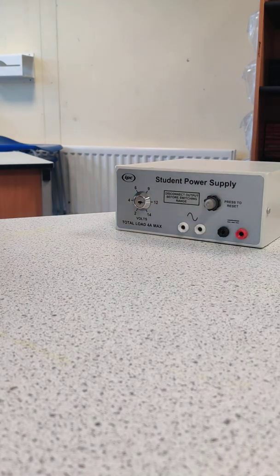In today's lesson we're introducing the idea of electrolysis, a technique that uses large amounts of electricity to split up a compound into their component parts. We'll particularly look at it as the technique used for extracting metals, but the purpose of this video is just to introduce the equipment that we use so that you can match that up to what you would see on a diagram.